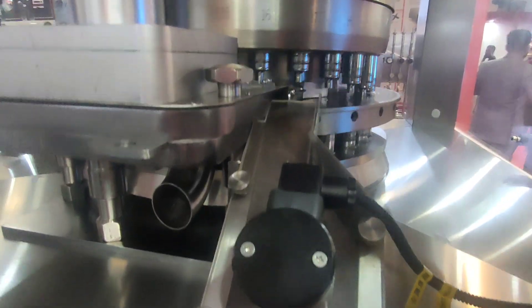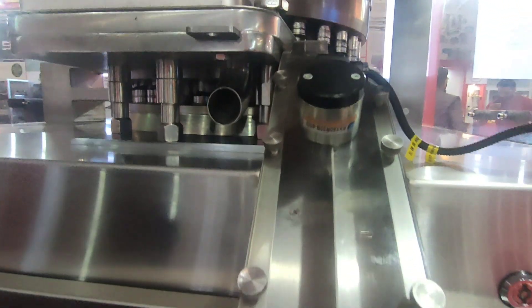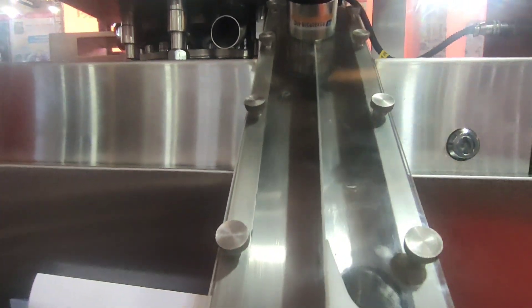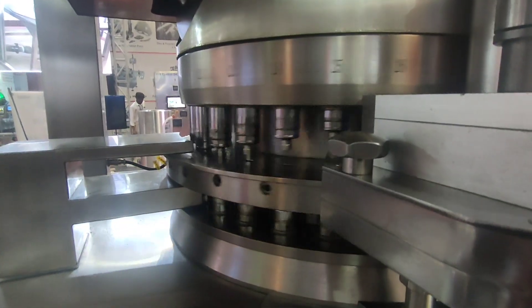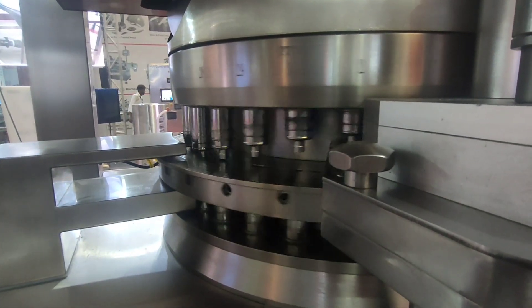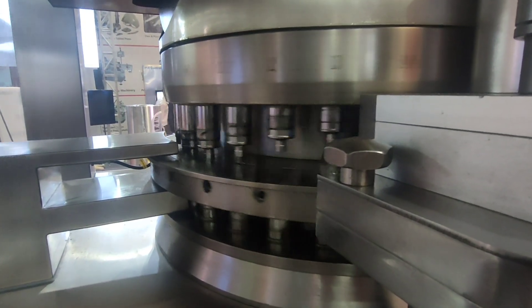These tablets strike with the swipe blade and are collected through the discharging chute into the container. This one is the discharging chute. For double feed tablet compression machines, the same stages are repeated for the second feed — filling, weight adjustment, compression, and ejection.